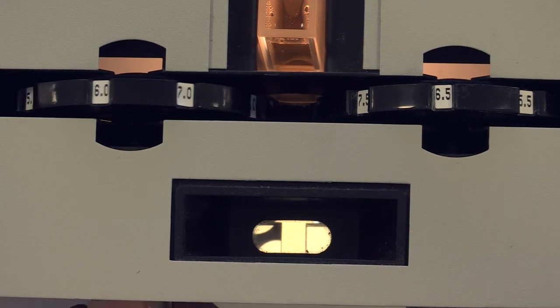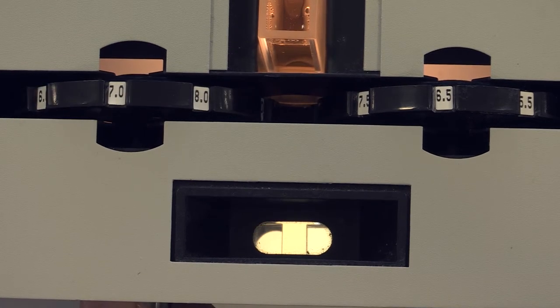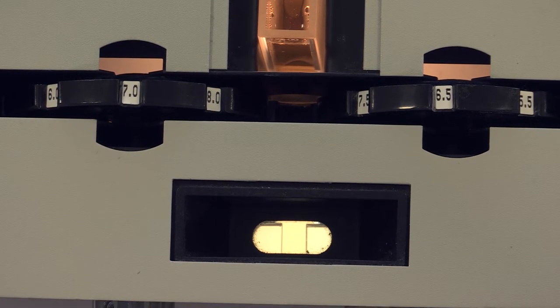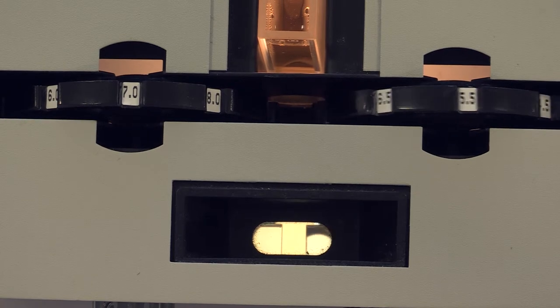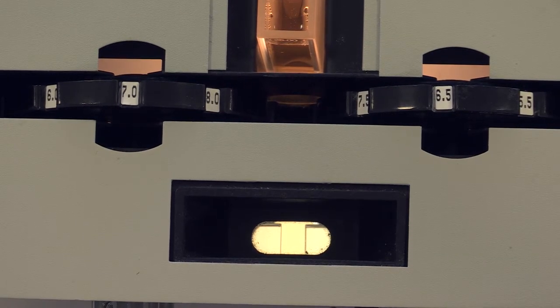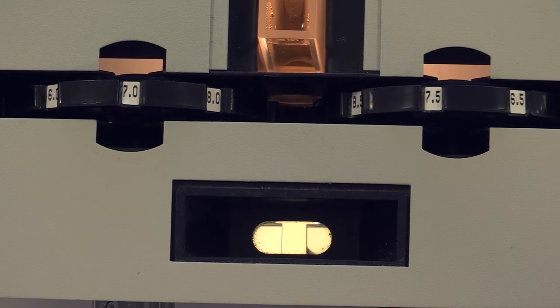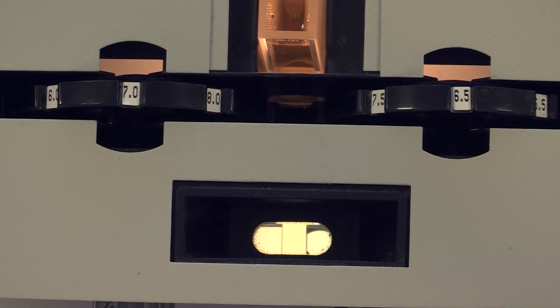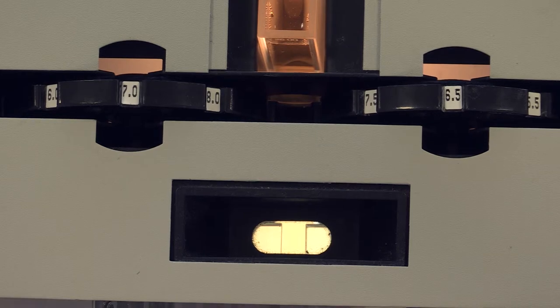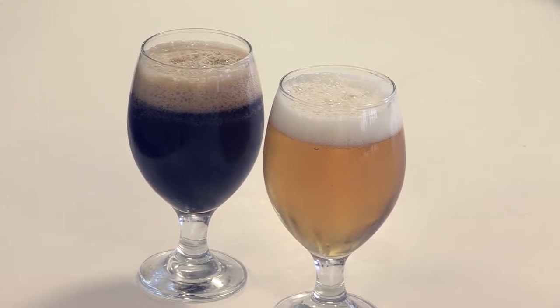We rotate the discs until our sample matches the colour of one or the other discs. The EBC colour units are then read from that disc. The EBC comparator can also come with a range of sample cells. These are precision glass sample holders of different path lengths, and we can use these if we don't need to dilute the sample.